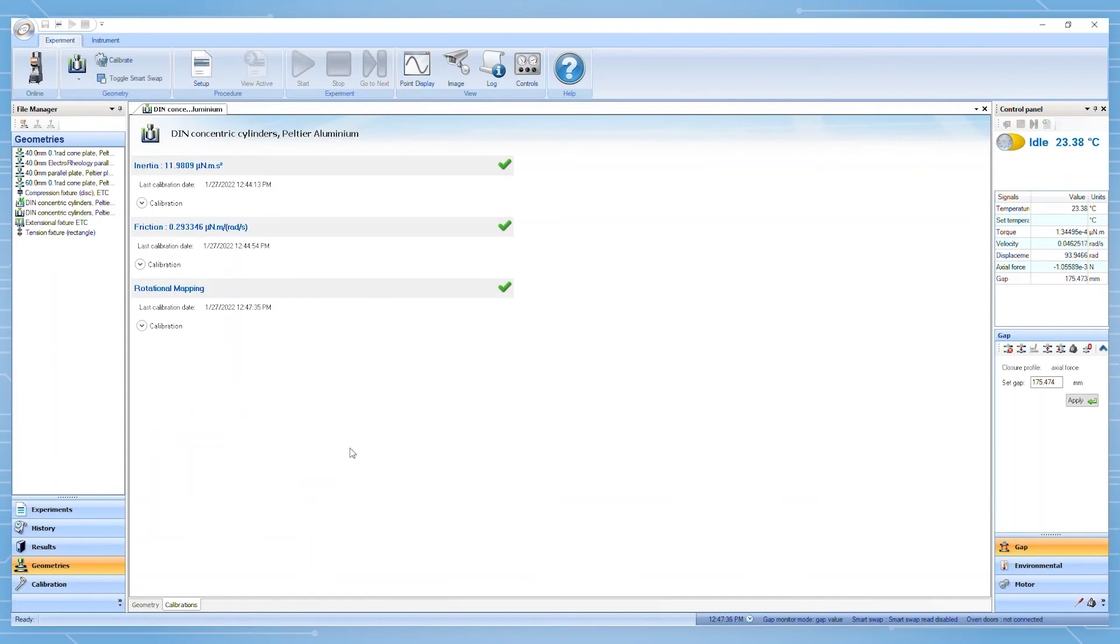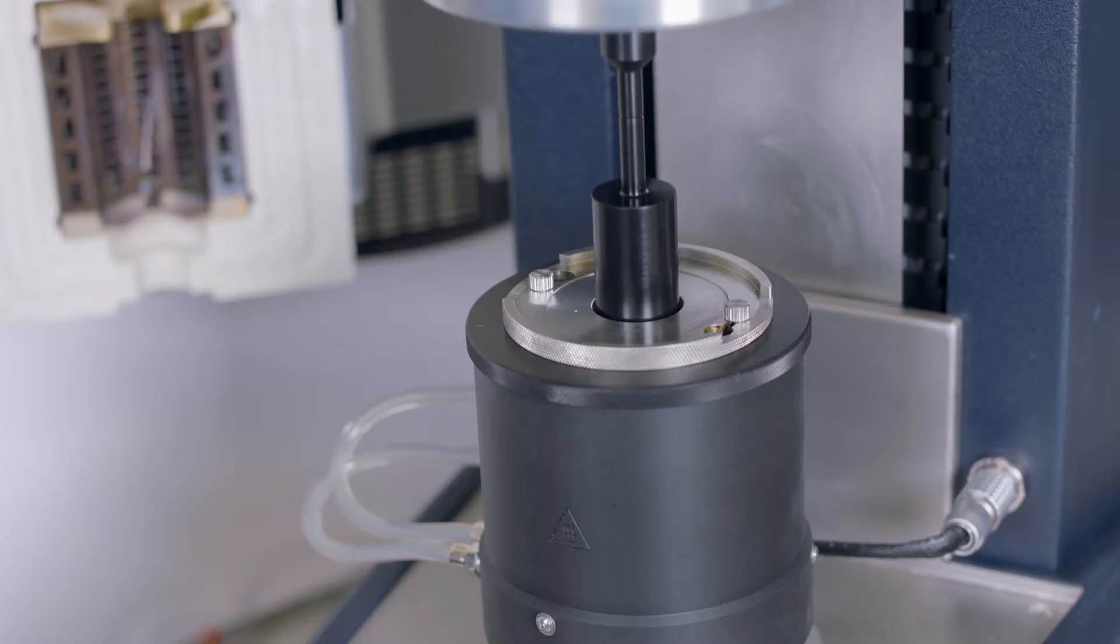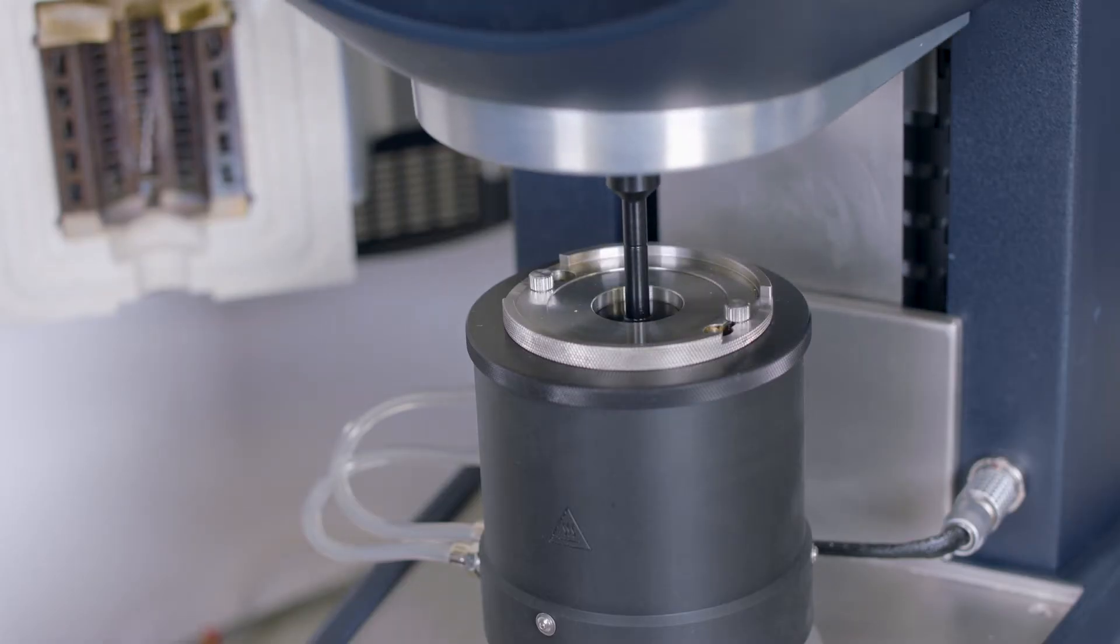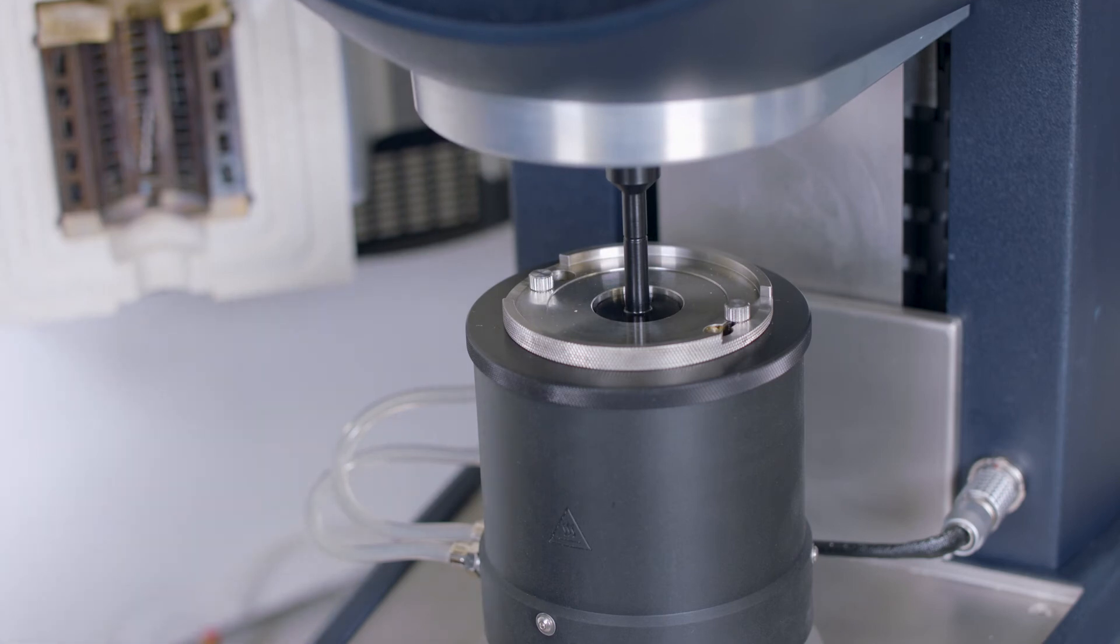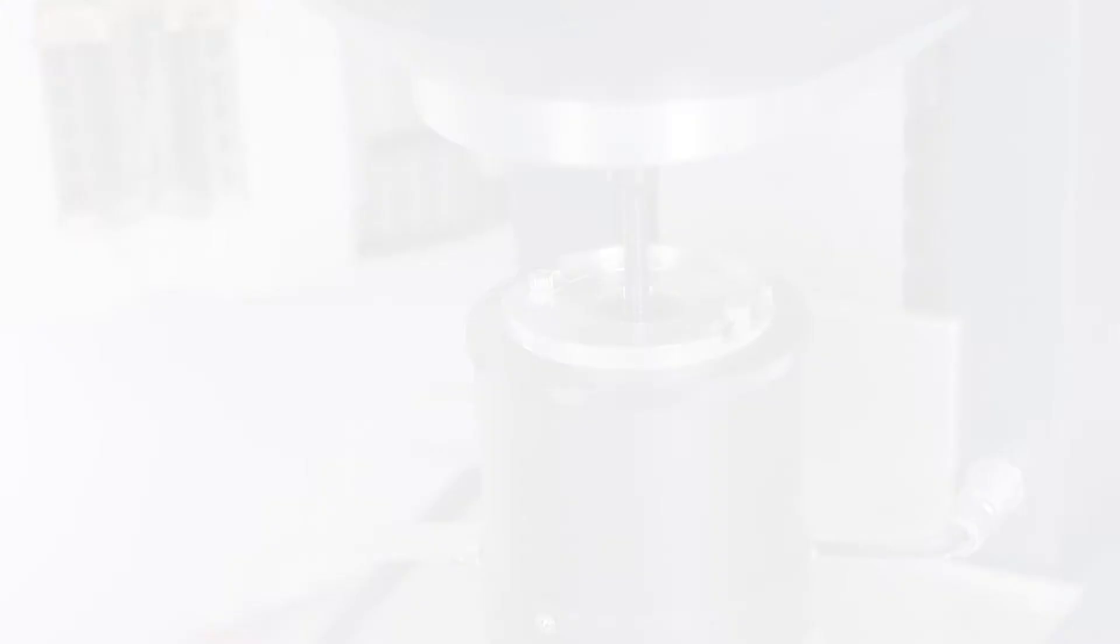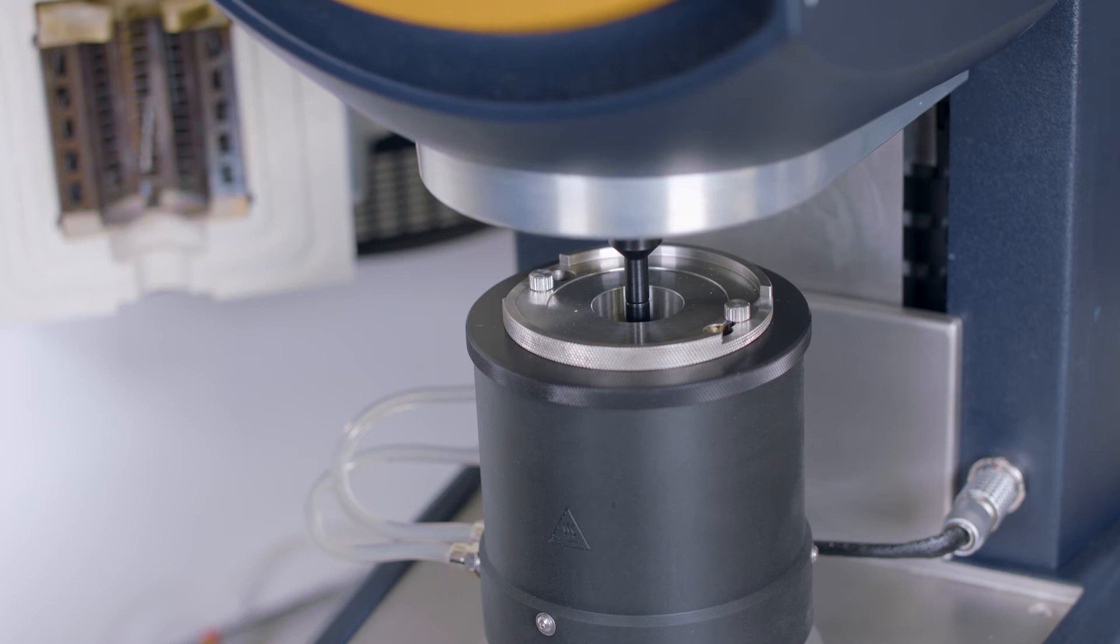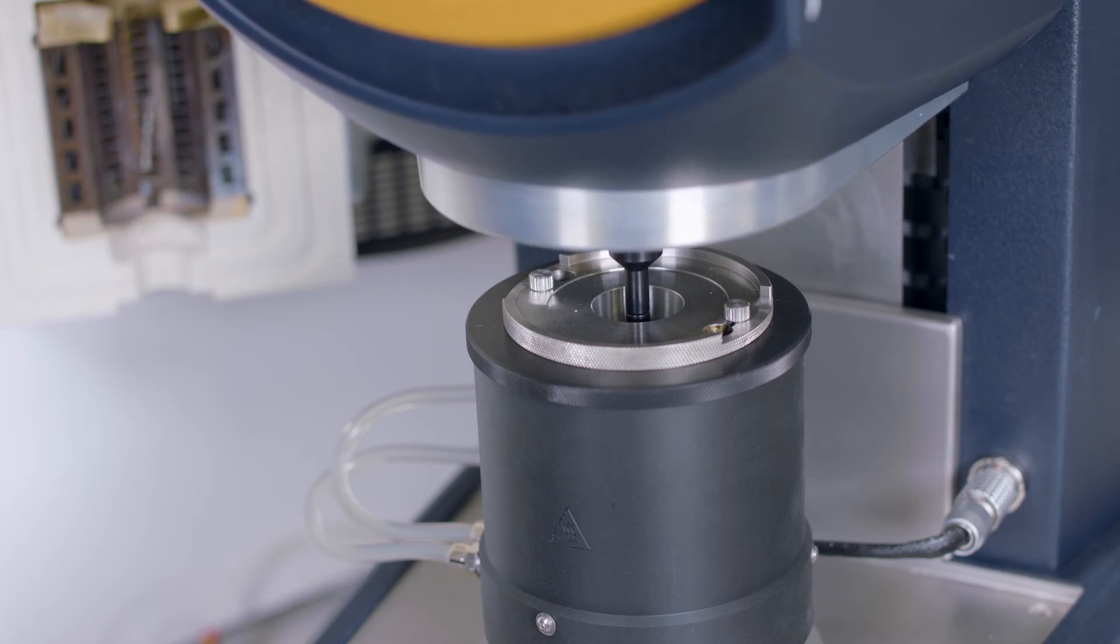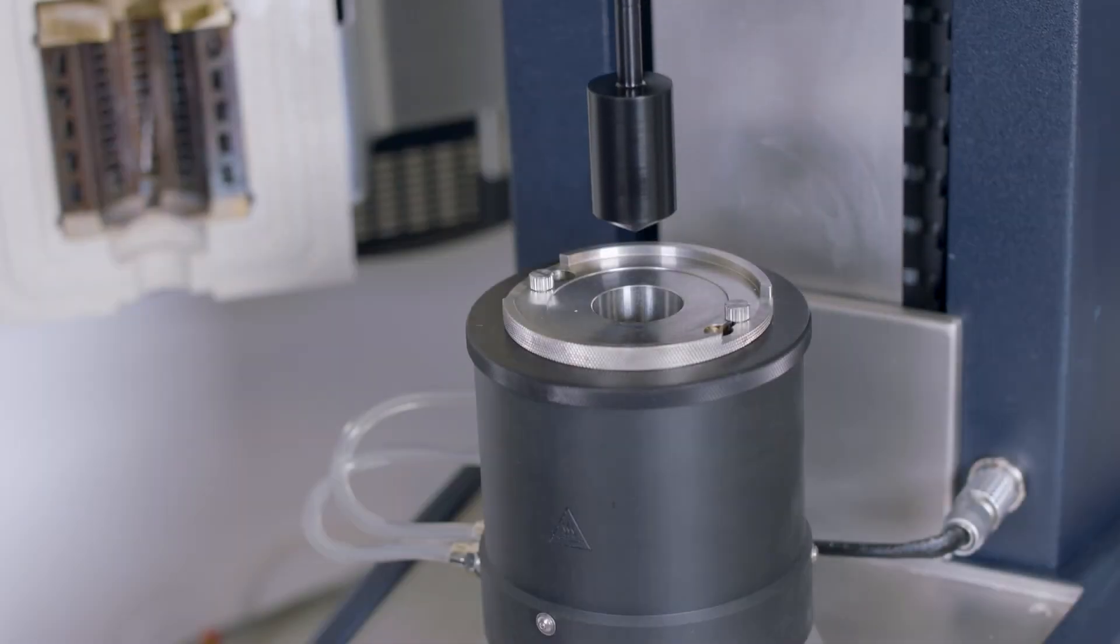After the calibrations are done, the next step is to lower the upper fixture closer to the cup by using the bottom arrow displacement key. After this, the zero gap button can be pressed and the instrument will proceed to zero the gap. After the gap is zeroed, the upper fixture can be raised back to the top.